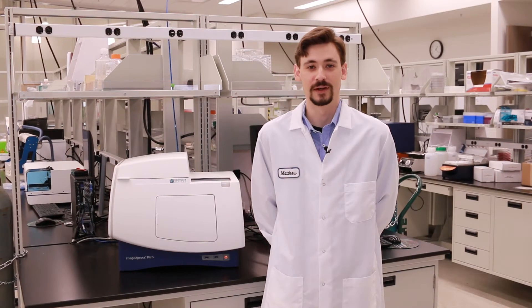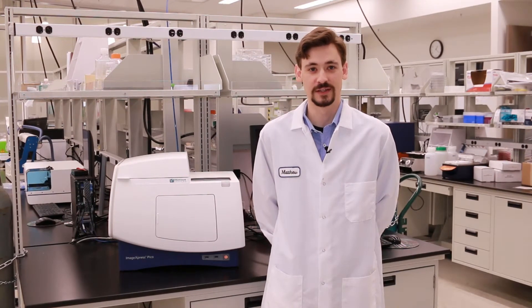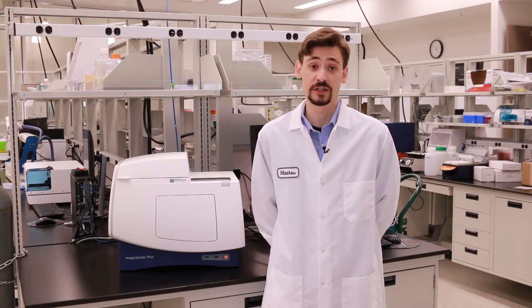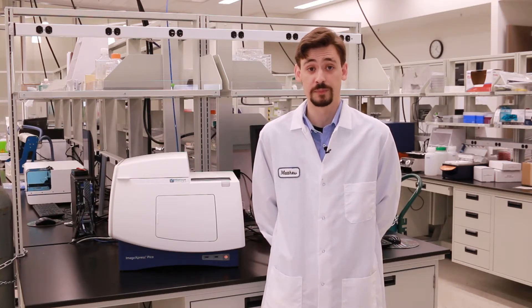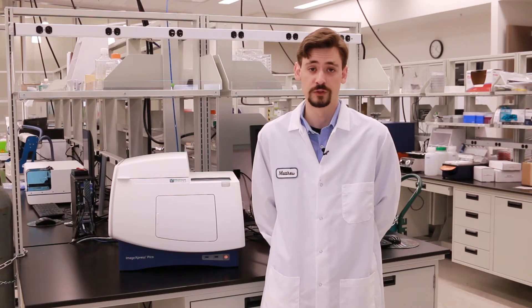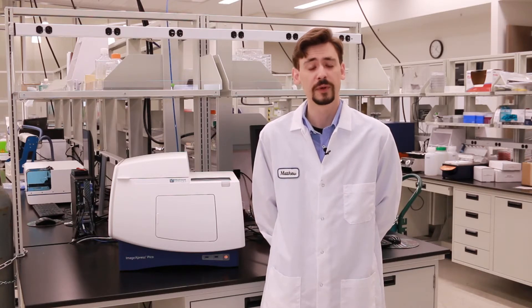Hi, my name is Matthew Hammer. I'm a Cellular Imaging Application Scientist here at Molecular Devices, and today in this video we're going to be covering the installation as well as the use of your ImageExpress PICO Environmental Control System, which is fully integrated to control temperature, humidity, CO2, as well as O2, permitting users to perform multi-day live cell time-lapse experiments.